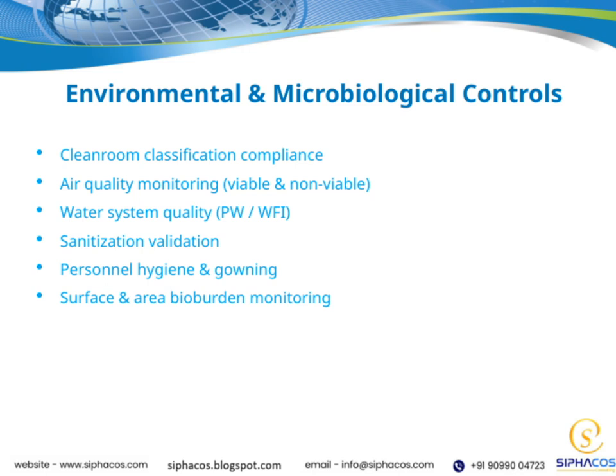Personnel hygiene and gowning are also essential. Proper gowning protocols and hygiene practices help prevent introducing contaminants into the cleanroom. Surface and area bioburden monitoring allows us to detect microbial presence on surfaces and in the environment, ensuring ongoing cleanliness.